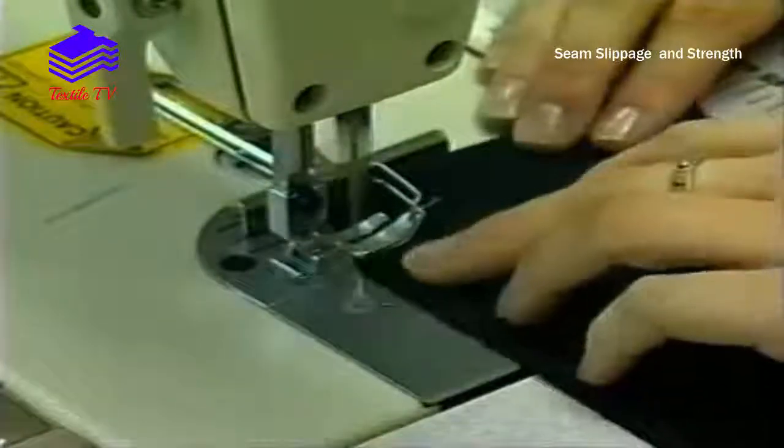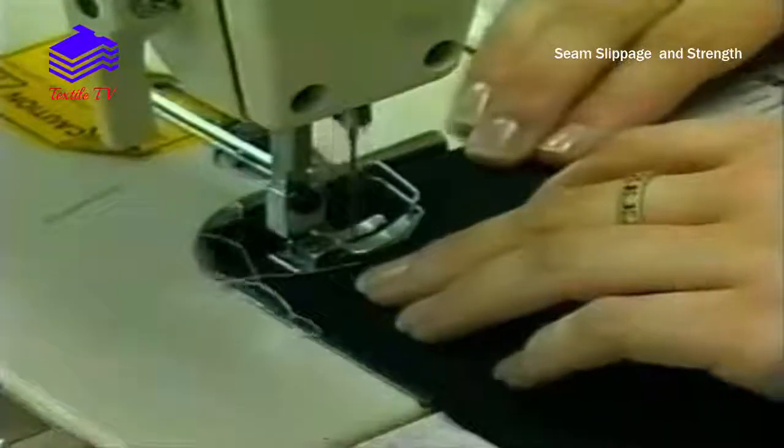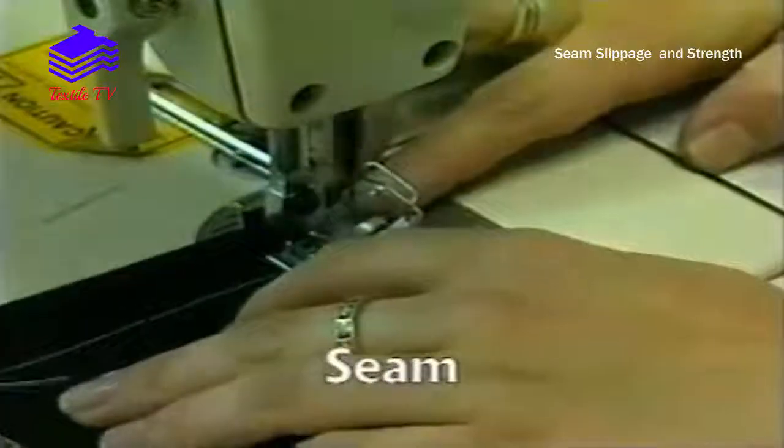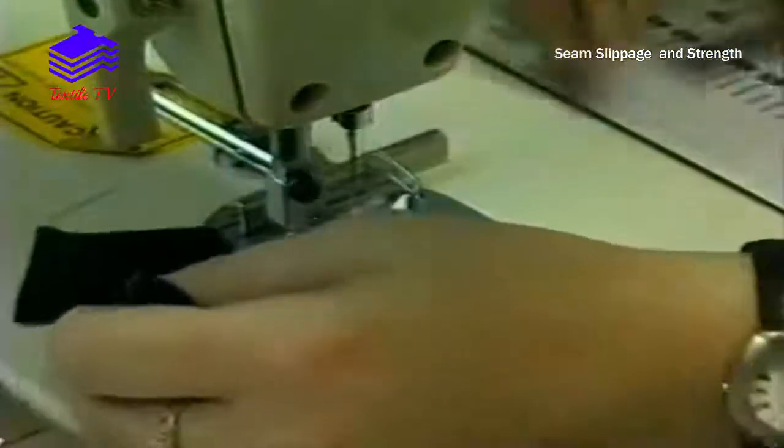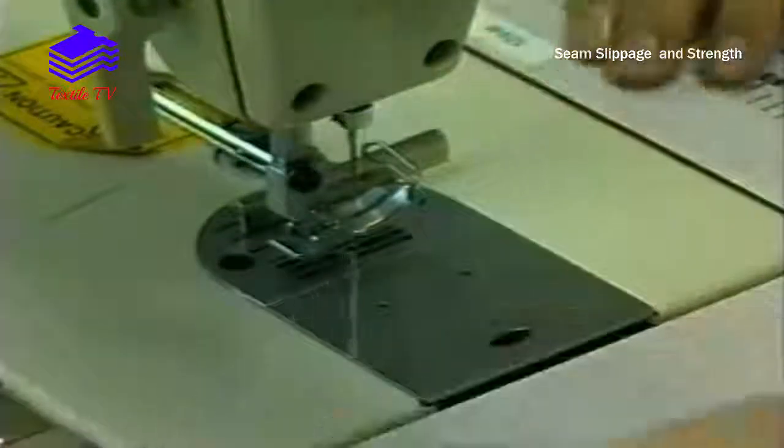Seams are prepared using a specified sewing thread, style of needle, type of seam and seam allowances, and number of stitches per unit length.